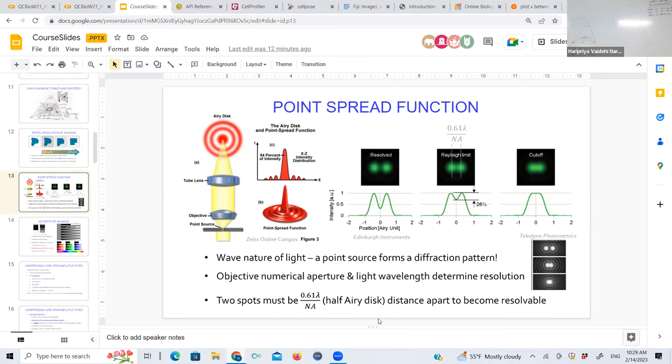Essentially, if you change the refractive index, you bend the light such that you increase the cone. And so it's actually the refractive index times the sine of that angle. Cool. But anyway, that is a lot of information that you don't necessarily need to know or remember. The takeaway from this is that there is a minimum distance needed to be able to resolve spots, and that is wavelength dependent. And the shorter the wavelength, the better you can resolve. Any questions? A quick question, Harry.